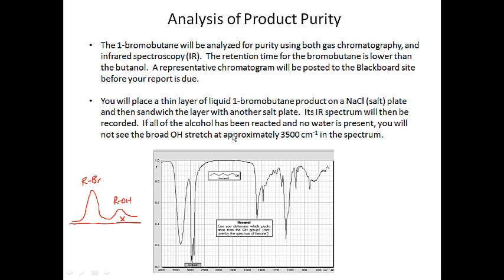When you have, for instance, a carbon attached to an oxygen attached to a hydrogen in an alcohol, this OH bond vibrates back and forth at a particular frequency, and that frequency turns out to be the same as that of a particular type of infrared light. So this OH group vibrates back and forth at an infrared frequency.